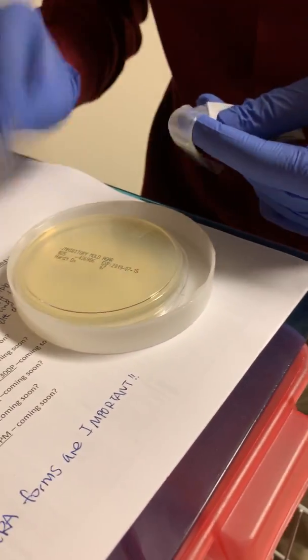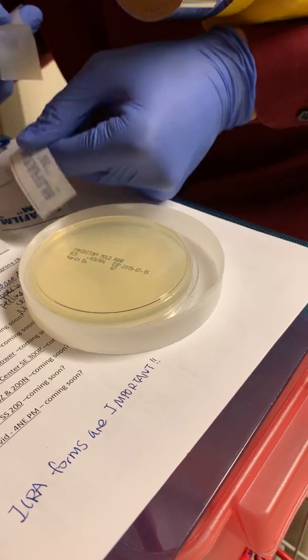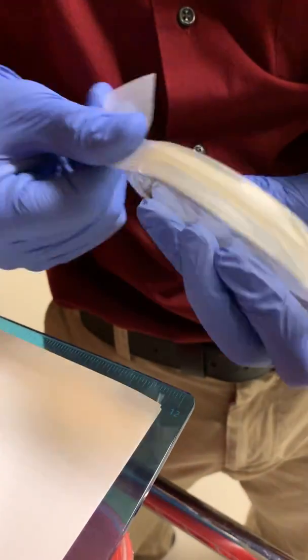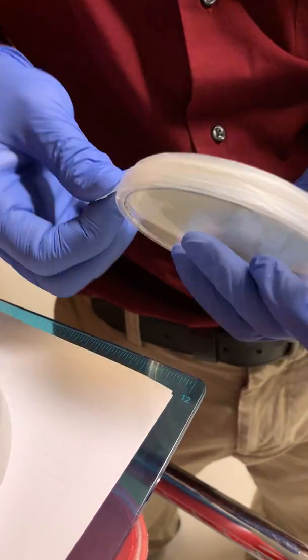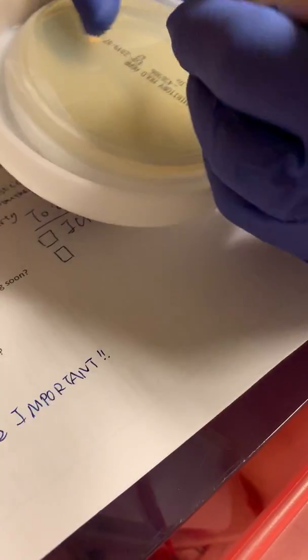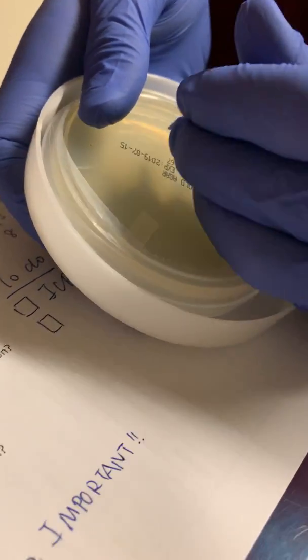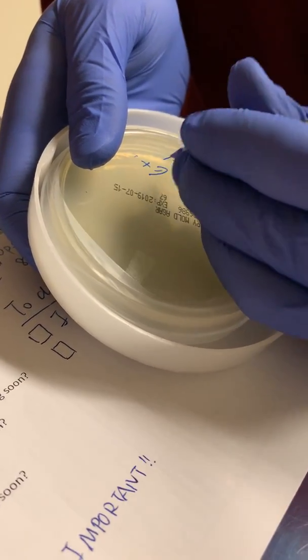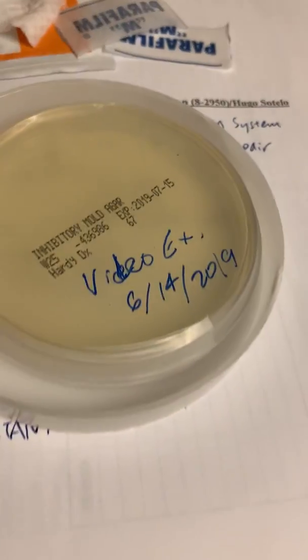Now we wrap the plate with parafilm. This is to make sure that no more air gets in. Then we label it and get ready to send it off to be incubated at room temperature. You write the description of the sample and then the date. You bag it and turn it into your lab to be incubated — and it should be ready to go. Thank you.